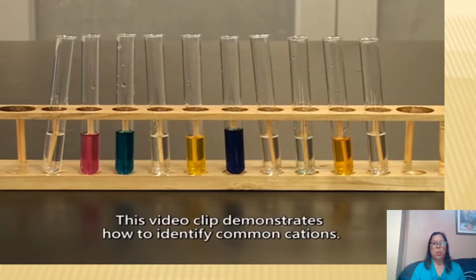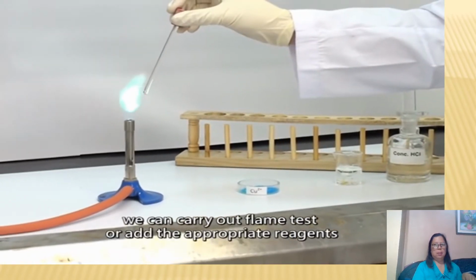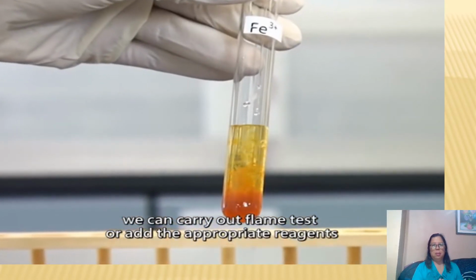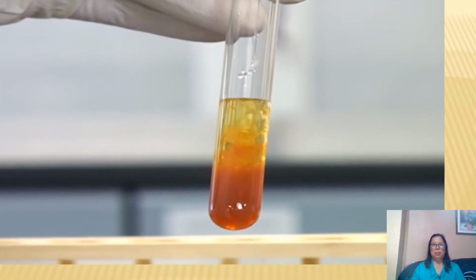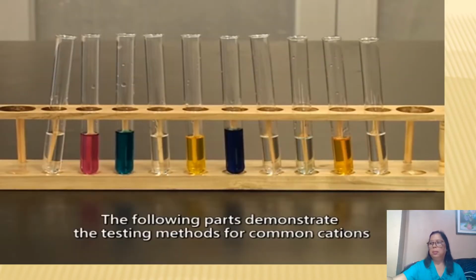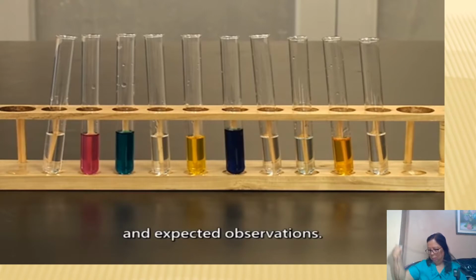This video clip demonstrates how to identify common cations. To analyze what cation is present in a sample, we can carry out flame tests or add the appropriate reagents and observe the chemical changes. The following parts demonstrate the testing methods for common cations and expected observations.